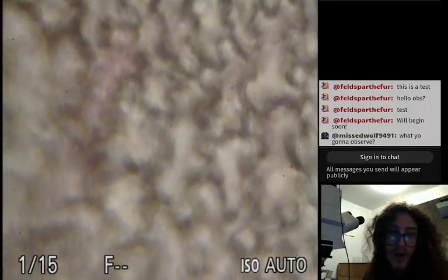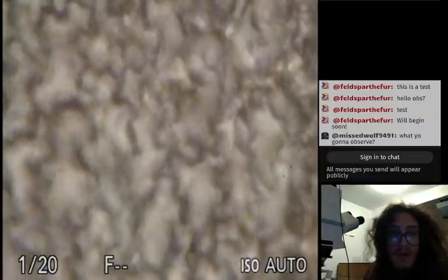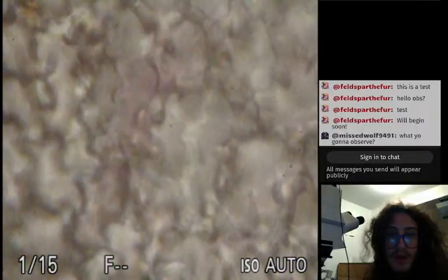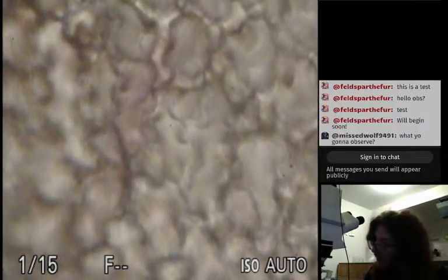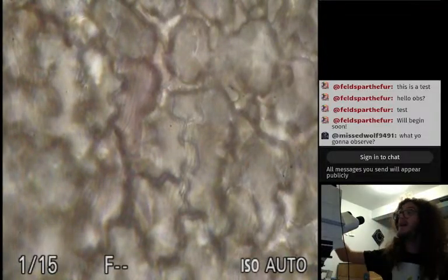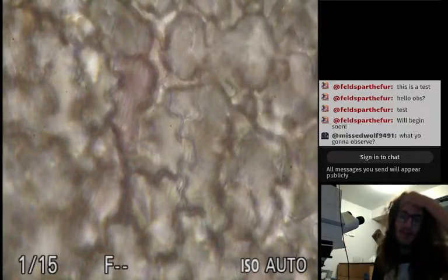We are now at 40. And things look big. And this might be where flat light will help us because we're getting focusing artifacts. There we go. Also gonna snap a picture of that. It's pretty neat. Boom. Snapped. Okay.